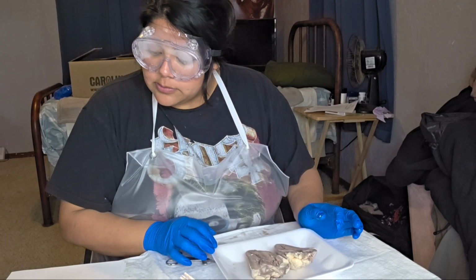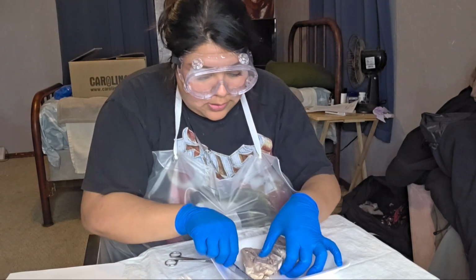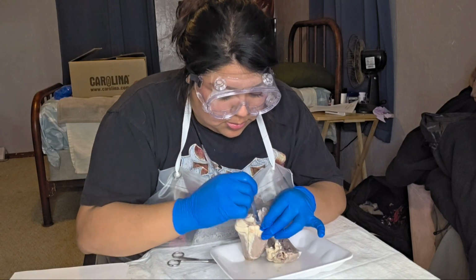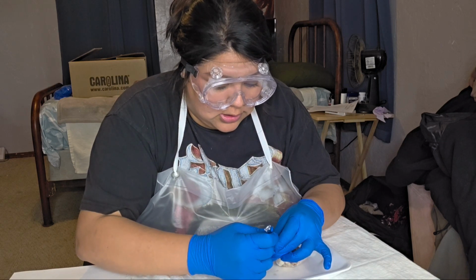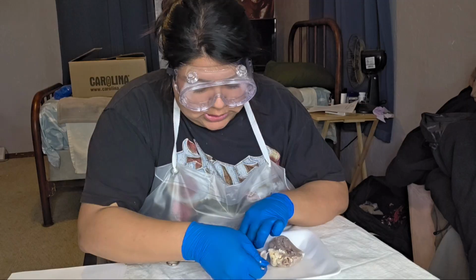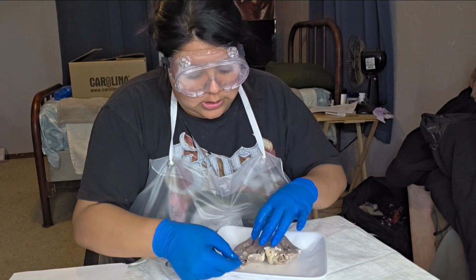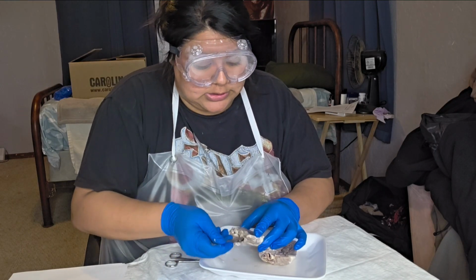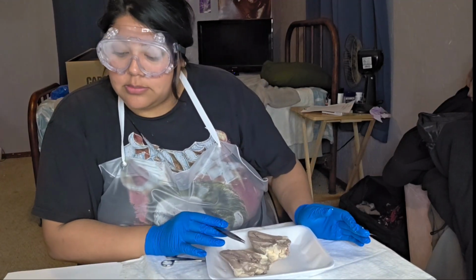Inside the right ventricle, locate the pulmonary artery that carries blood away from the chamber. Okay, so here we see our pulmonary valve. And if we stick our tweezers into there, we can see that it goes down inside the right ventricle. We can see here our pulmonary valve, at the base, where the pulmonary artery goes into the right ventricle. Boom.